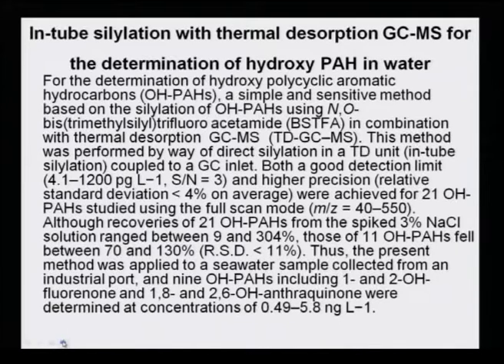This method was performed by way of direct silylation in a TD unit, that is, in-tube silylation is carried out coupled with a GC inlet.